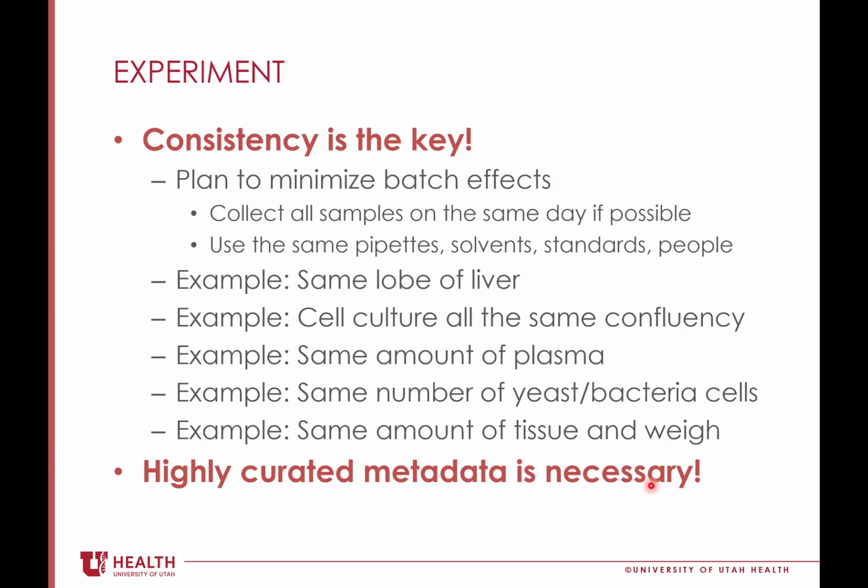And I realize that's not always possible, but really try to do that, especially on simple experiments to collect. Use the same pipettes, the same solvent standards, use the same technician to do it. Just be as consistent as possible to minimize those effects. Other examples of consistency is same lobe of liver.